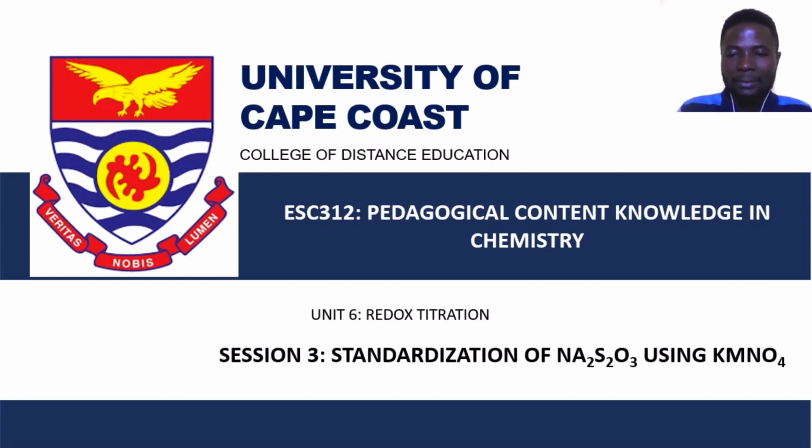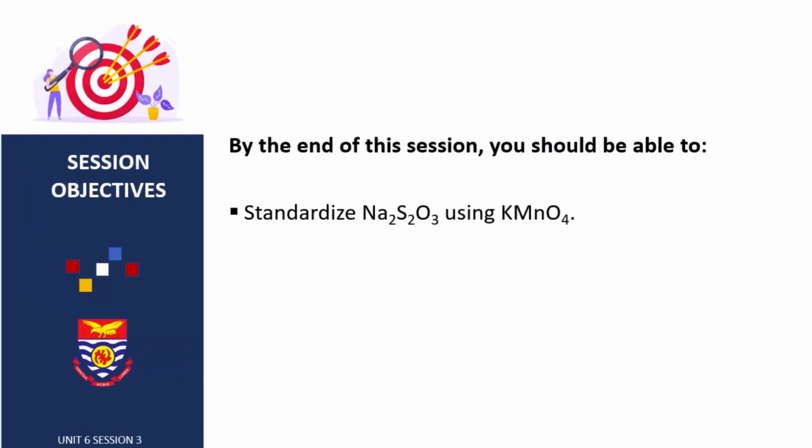In this session, we are going to look at standardization of sodium thiosulfate using potassium permanganate. Now our objective. By the end of this session, you should be able to standardize sodium thiosulfate using potassium permanganate.